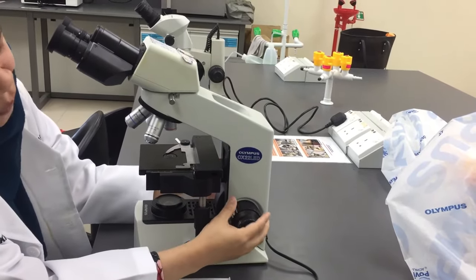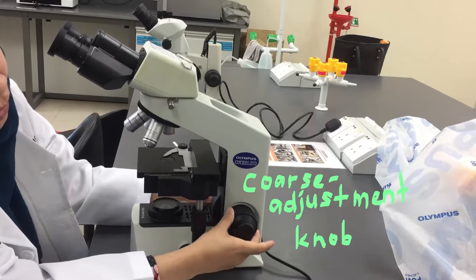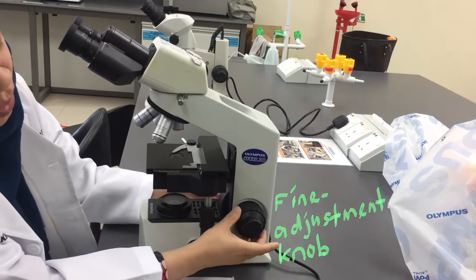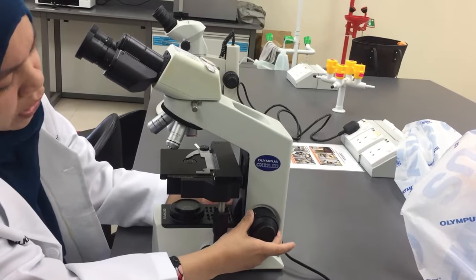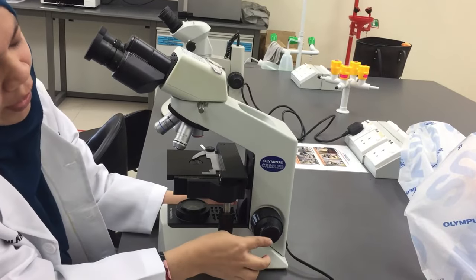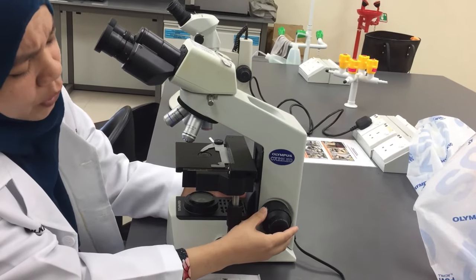You have here the two-knob adjustment. The bigger one is the coarse adjustment knob and the smaller one is the fine focus adjustment knob. The function of the coarse adjustment knob is to move the stage up and down, and the fine focus knob is to focus the specimen sample that you want to visualize.